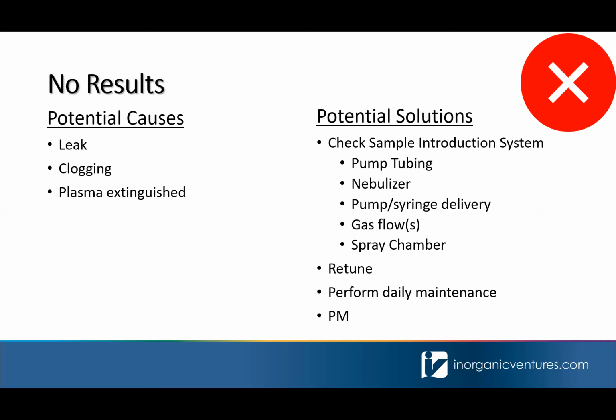So you have gone through the process of ensuring that your working solutions are stable, you've got your instrument tuned properly, and then you go to run your analysis and realize that you're not getting any results. This is a bit concerning, and you can feel defeated when this happens. But typically, when you see no results, this is commonly related to maintenance type issues. So what we recommend is you take your system down to the most basic elements and then build back in complexity as you progress through your troubleshooting.